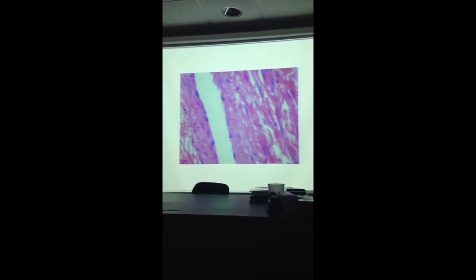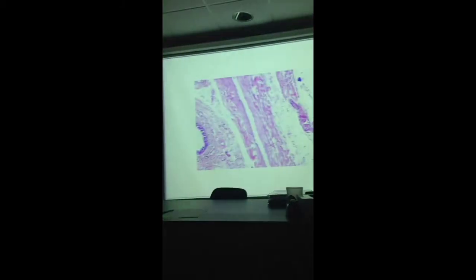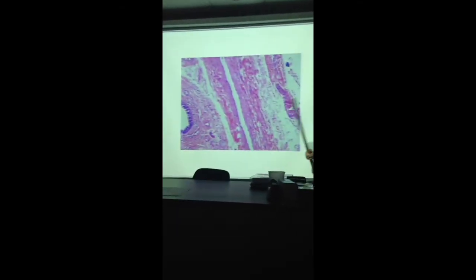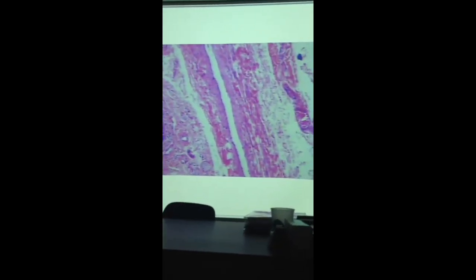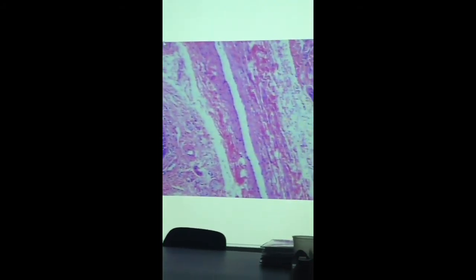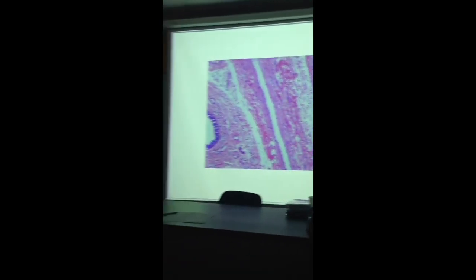How do we know it's not an artery? You can see it's very large, relatively thin-walled, with a very large lumen, and usually collapsed or partially collapsed when there's no blood in it. Remember, veins tend to be larger than the corresponding artery, and since they carry blood at much lower pressure, they have a much thinner, weaker wall. That's why they usually don't hold their shape in these tissue sections when there's no blood in them.